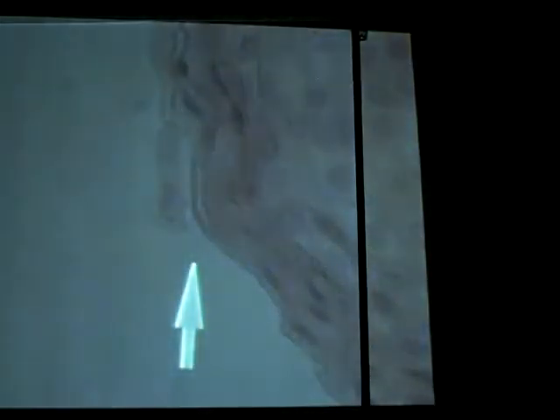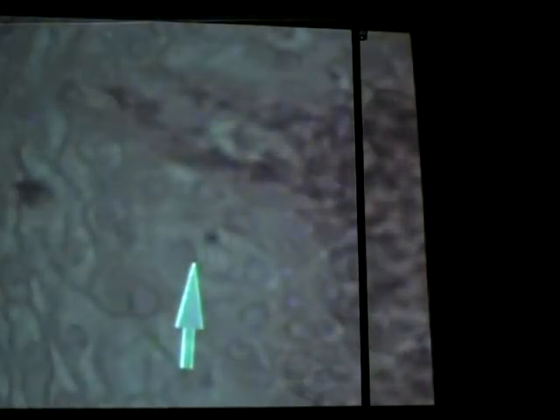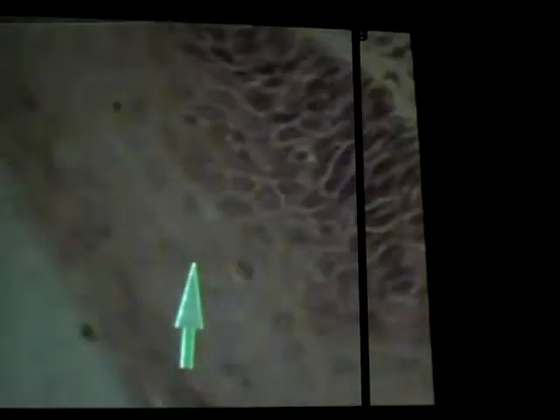Alright, so if we look at our epithelia here, notice we have these very flat cells at the top. So that's our stratified squamous epithelium. Alright, we're not really seeing those large balloon-shaped cells like we saw in our bladder. Alright, and then back a little more to show you the sinuses. And then you have these large sinuses that are going to become filled with blood.